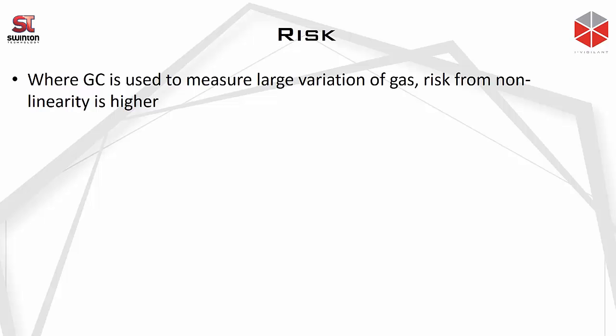So it might have quite a big variation of gas composition, and when we have a large variation of gas, we have a higher risk from the nonlinearity.